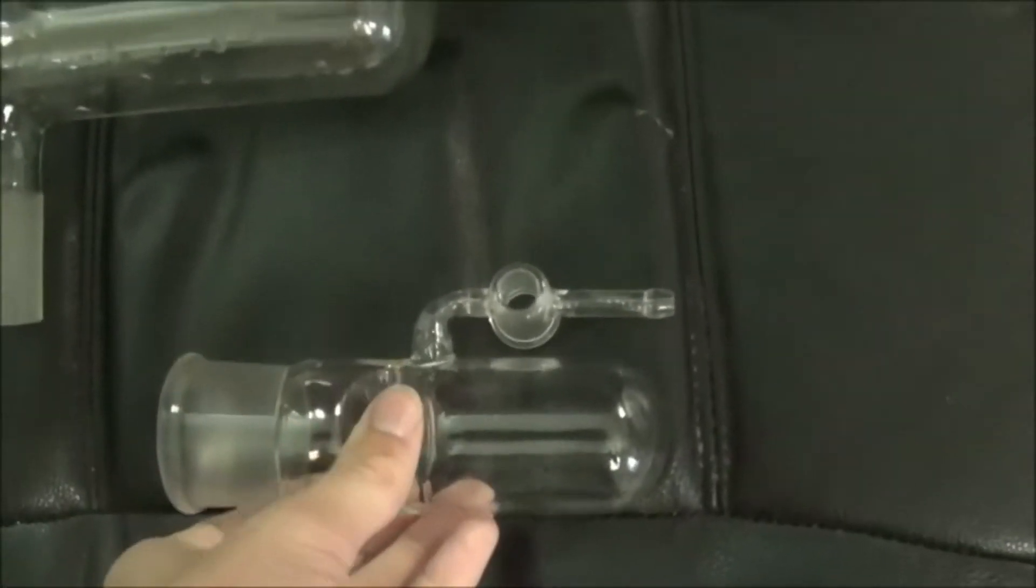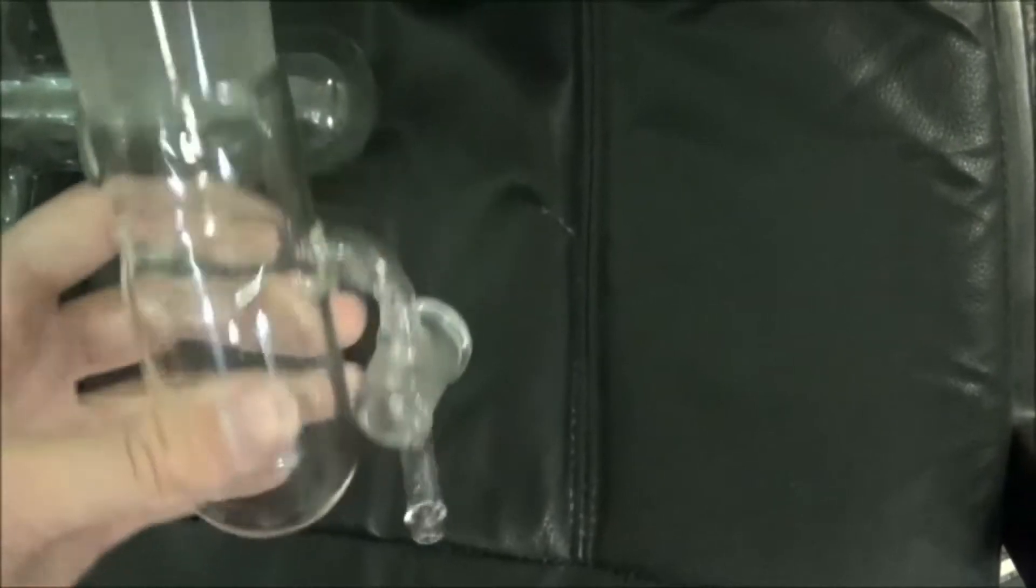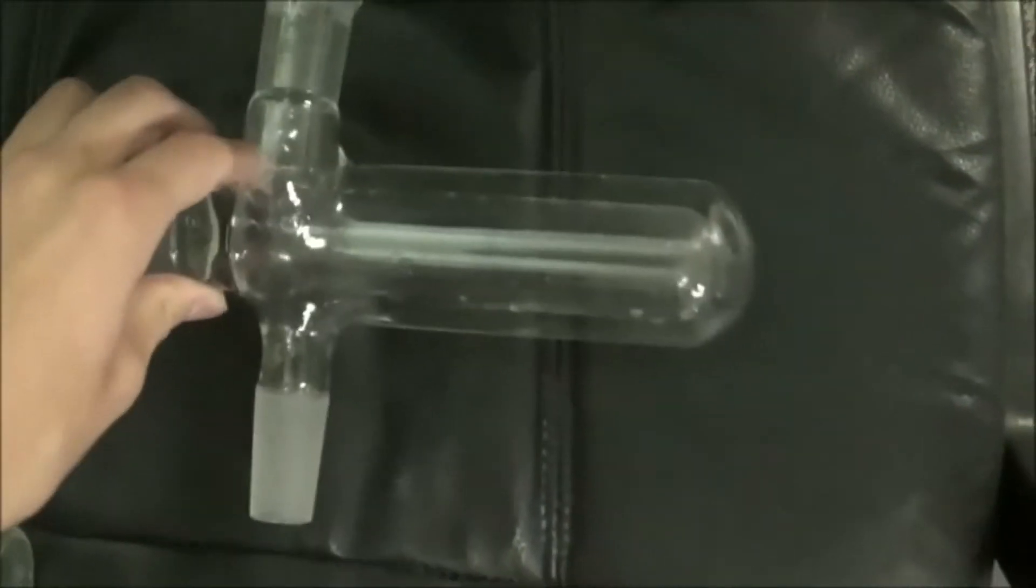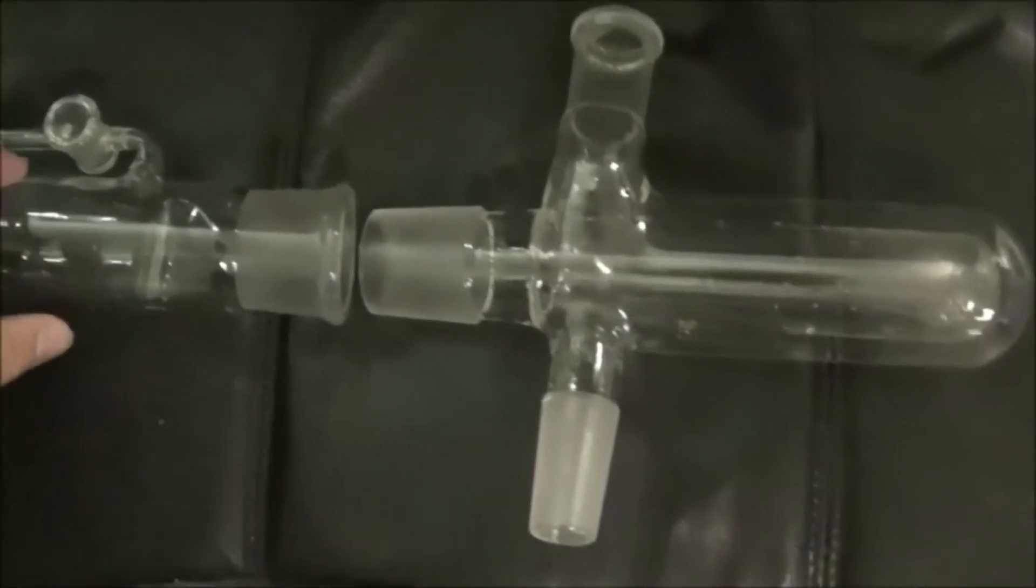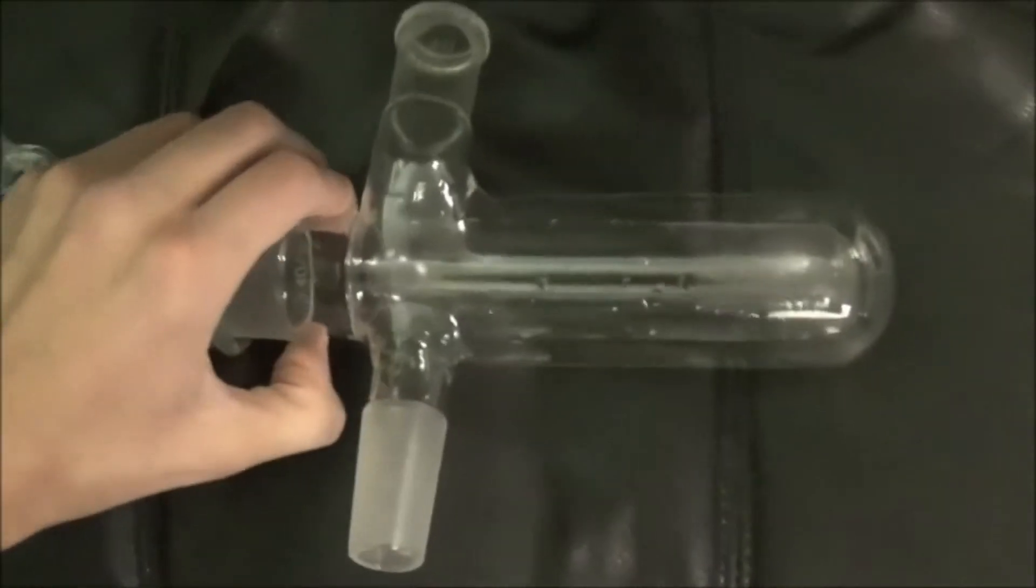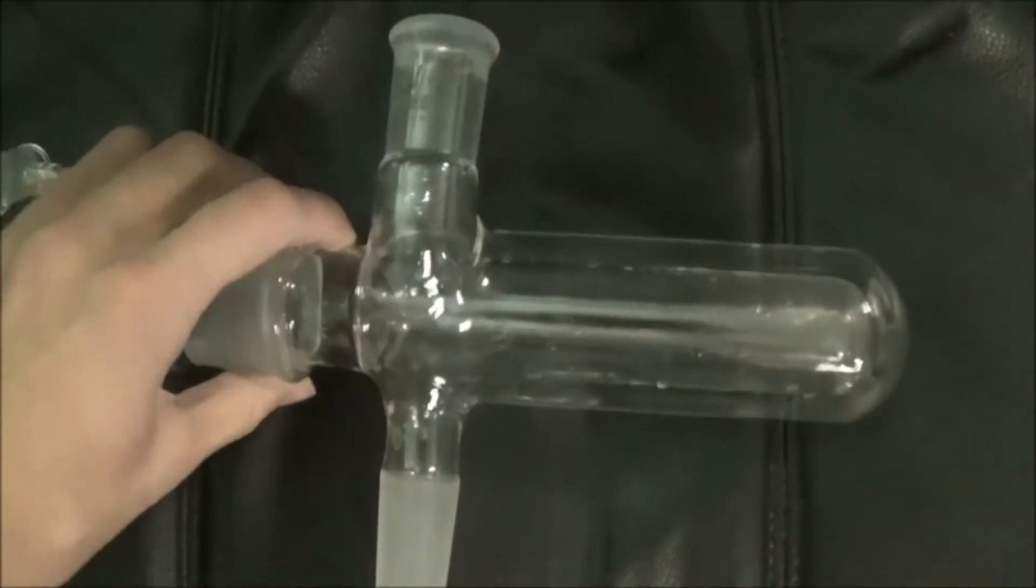Here is the drying chamber. It fits on the end of the other piece of glassware. Notice the ridge. This is to keep the drying agent in the chamber. It also has a stopcock to control the flow of gas out of the apparatus. The joint is rather large in order to fit a large sample into the drying chamber.